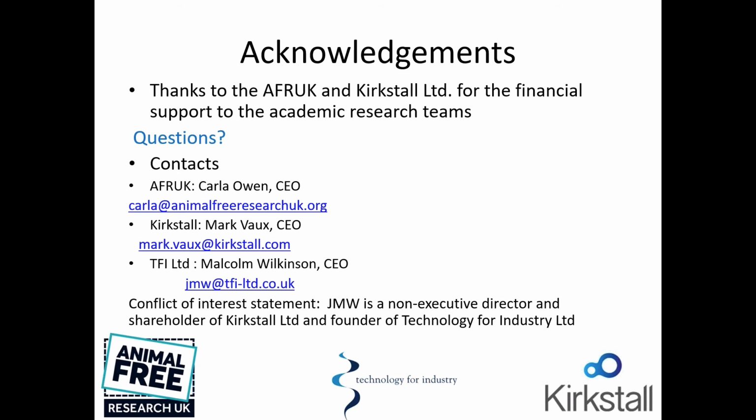Can the cells in Quasi Vivo be in 2D monolayer or 3D structure? So either 2D or 3D. And then a follow-on question: can Quasi Vivo work with multiple cell types?